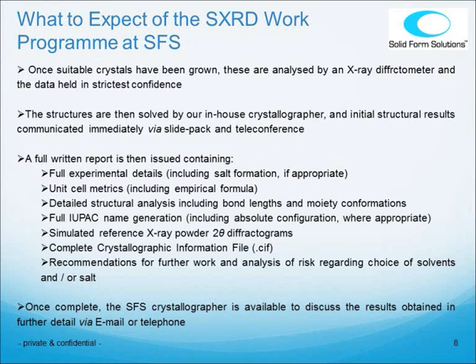Detailed structural analysis, including bond lengths and moiety conformations, which may be useful, say we have something in a chair conformation. Full IUPAC name generation, including absolute configuration wherever appropriate. Simulated reference X-ray powder diffraction 2θ diffractograms for later use, say for manufacture batches if it's of use. Complete crystallographic information file, so the CIF file, for use in later regulatory or publishing purposes. Recommendations for further work and analysis of risk regarding choice of solvents and/or salt.